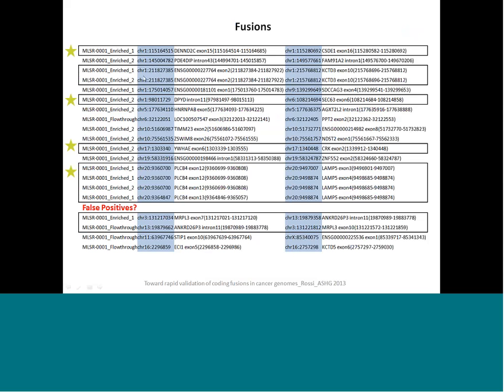A number of these we have to go back and try to confirm by PCR, and usually this is just the simple endpoint PCR, but it's a matter of going back and redesigning primers. Depending on the complexity of the rearrangement, you may have to design several primer sets to be able to know exactly what the fusion product is and to test it appropriately.